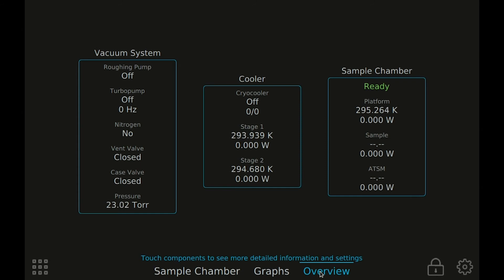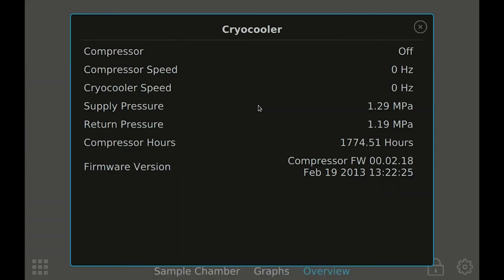The overview is the place to come if you want to see more details about all the components in your system at a single glance. This screen is useful when learning more about how your system works or when troubleshooting issues. The components in your system are grouped into subsystems like the vacuum system, the cooler, and the sample chamber. Depending on which options your system has, you may see other subsystems here as well. More details about each component can be found by pressing on the components — details like the number of hours, hardware, firmware versions, and diagnostic information can be found here.